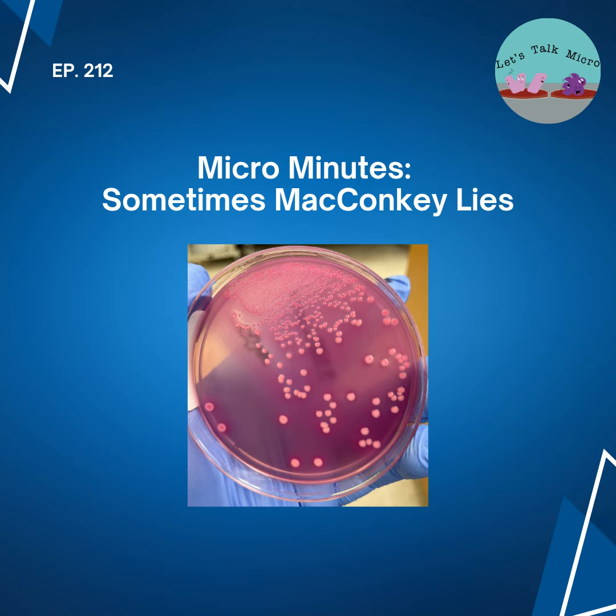And it is differential for lactose fermentation, right? Enterobacterales like E. coli and Klebsiella ferment lactose. And then you have organisms like Salmonella, Shigella, and Proteus that do not ferment lactose. So MacConkey is selective and differential.